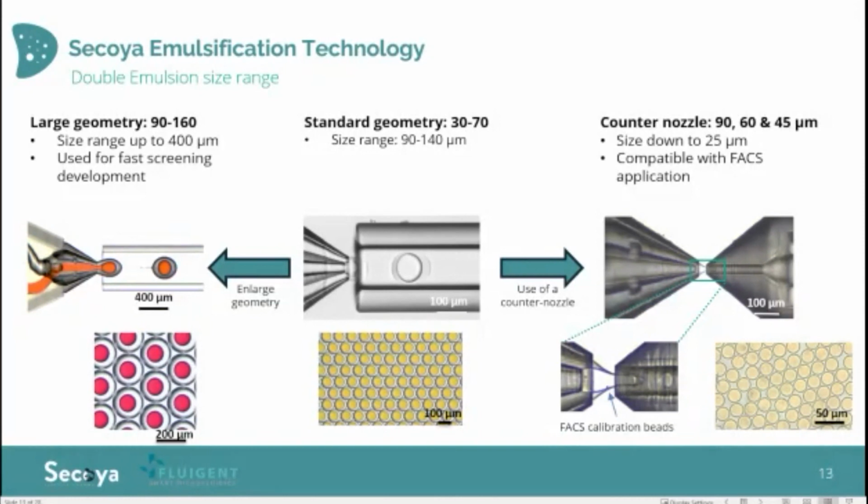It's doable. Yeah, from our knowledge, when we were discussing, below 30 micrometer for FACS was acceptable. After that, we never saw lower than 25 or 23 micrometer, but if it's a need, we can discuss.